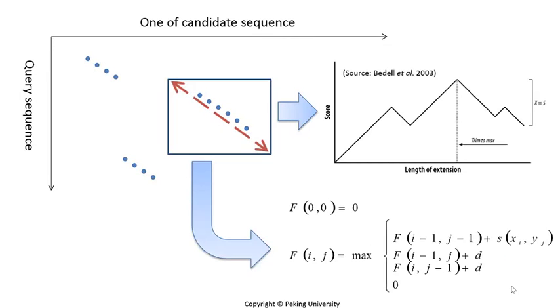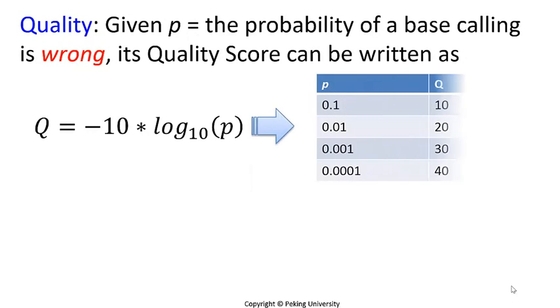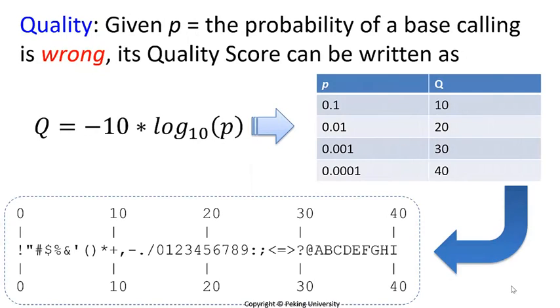After the seed hits have been found using indexes, we can extend outward from the 2 endpoints of each seed hit, as BLAST does. Then we can use dynamic programming to get the final alignment. However, please note that NGS read mapping differs from searching databases with BLAST, in that the NGS suffers from a higher error rate. We need to consider whether a mismatch is in fact an artifact made by sequencing error.